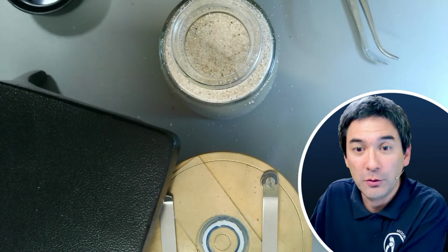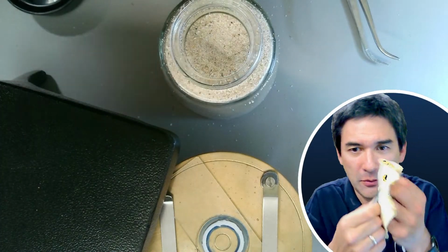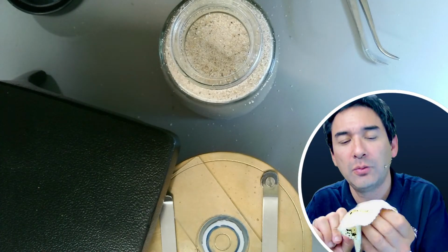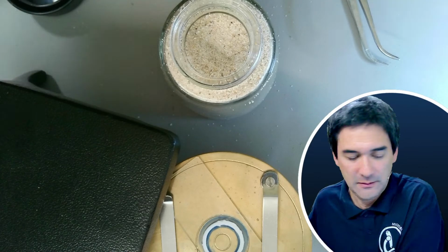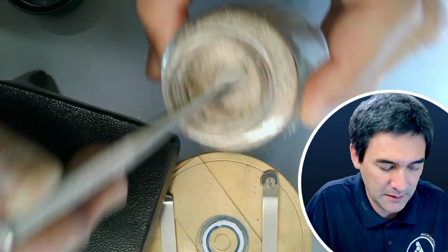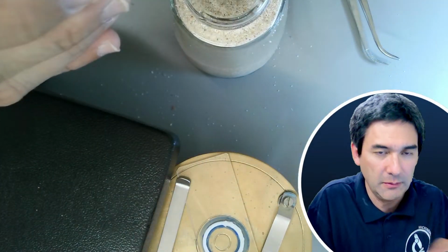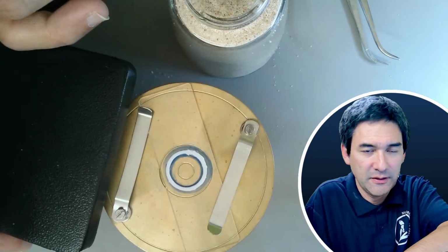Okay. You always want to not cross-contaminate. So I'm going to wipe off the tweezers here. And let's use a little bit of this here again, and carefully fill it in. You're not able to see this. So here we go.